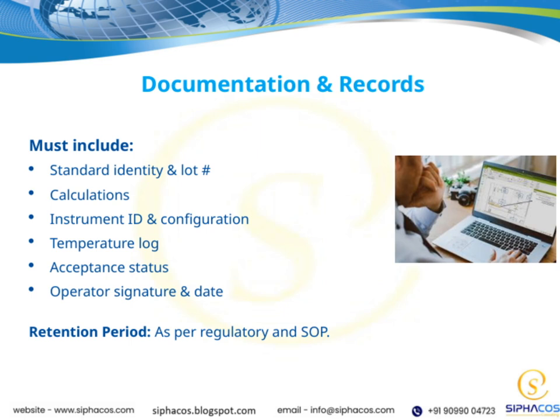Finally, it's important to remember that these records must be retained for the specified period, as dictated by regulatory requirements and our standard operating procedures. This ensures that we can review and verify our processes at any future point if needed. All these elements together form a comprehensive record that supports quality, compliance, and traceability throughout the process.